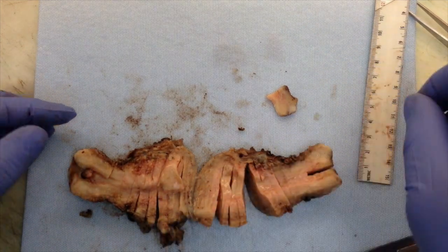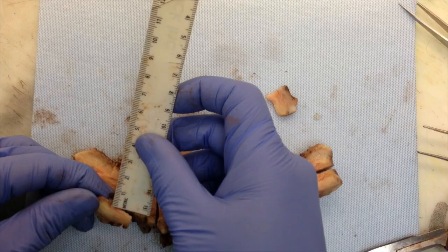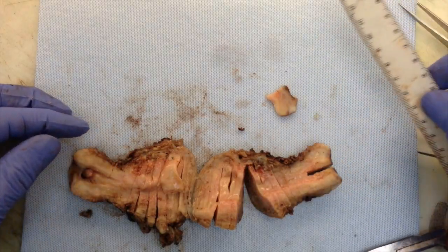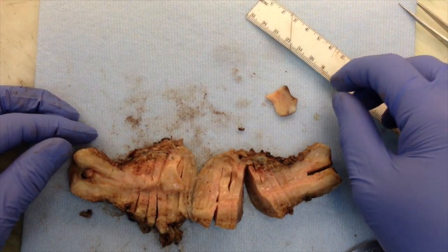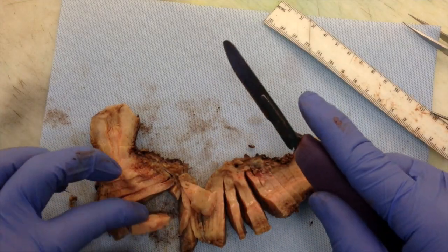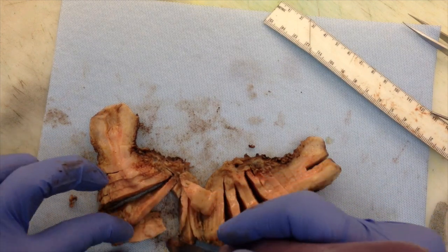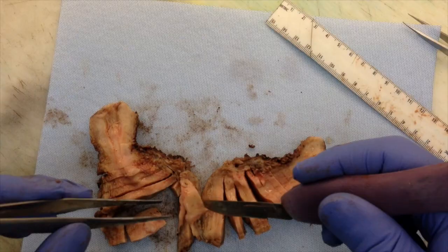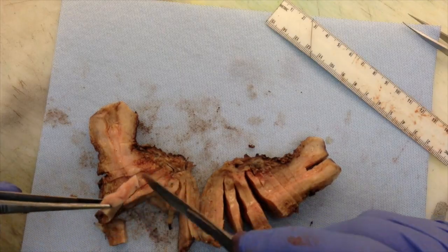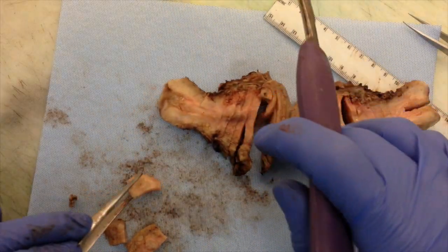There is a cervical polyp (0.7 by 0.6 by 0.2 cm) on the anterior aspect. So my first section is going to be a full thickness, meaning you have endometrium, myometrium, and the serosa. And since there's nodules, I'm going to demonstrate nodules in the same section. But what happened was I didn't get the endometrium when I was bivalving, so the endometrium is here and not on this piece. So I'm going to have to take the endometrium from here, and it'll just be submitted in two pieces.